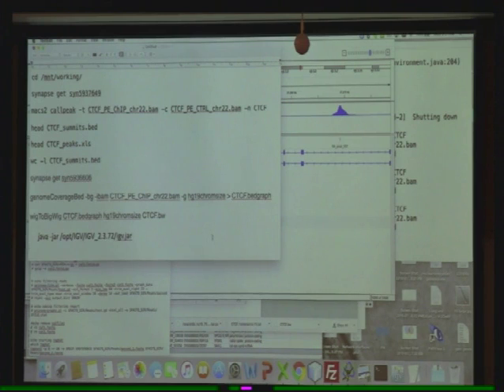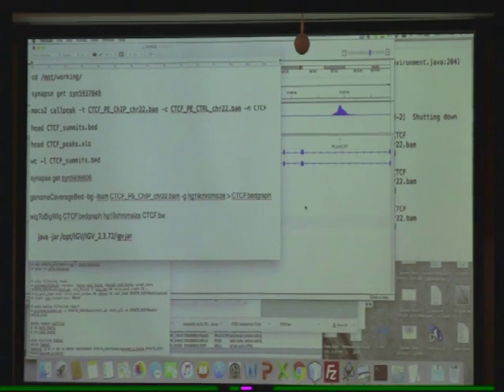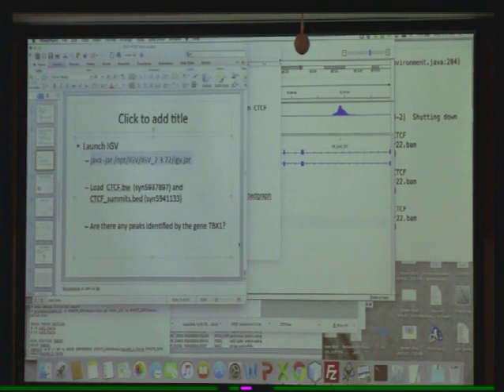You might just have to follow along for now. Okay. So what else can you do with this? Also, if you want, I've provided this Synapse ID.